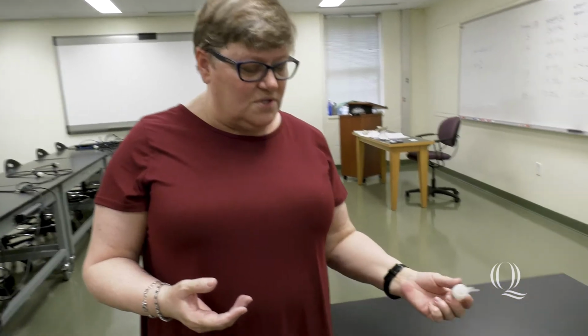A very similar mineral to calcite is dolomite. Whereas calcite is a calcium carbonate mineral, dolomite is a calcium magnesium carbonate. So I've added in some magnesium and I've changed to a different type of mineral. Because of the presence of the magnesium, dolomite does not react the same way as calcite does, just because of the addition of that magnesium. So I just wanted to show this to you.